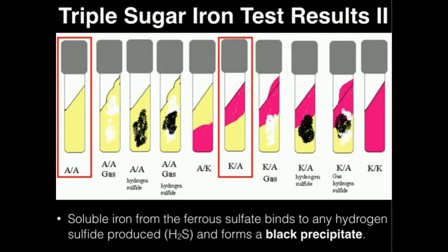If we have an abundance of alkaline end products, there's a tendency for the medium to turn cherry red — this is a good example of the cherry red right here. So if we have a majority of alkaline end products from peptone metabolism, it turns cherry red. However, if we have a majority of acid end products from sugar fermentation, it'll form a yellow color, like you can see on the far left.